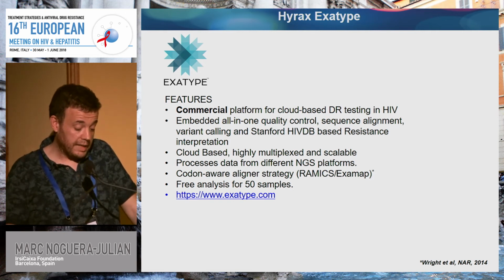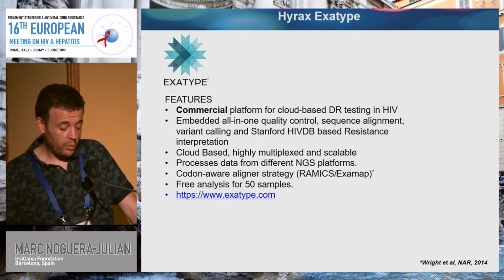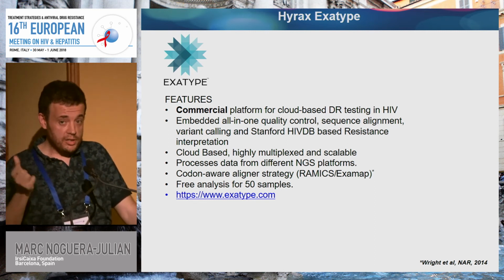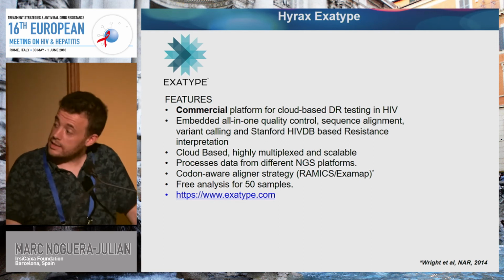And a very technical feature of this software, I think, is that it's using an aligner that is codon aware, that has been developed in that group. And that means that the insertions and deletions will be better treated with a codon-aware aligner. And you can try it at this URL here.